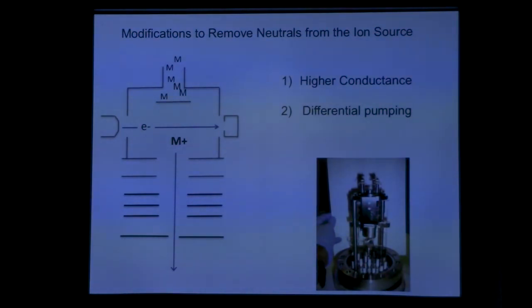And that gets them so upset that then they lose their own electron, and they become a positive ion, right? And so that's all very good, but we have now not just the CO2 or the other compounds that we're interested in, we also have this helium in there. So you're making a lot of helium ions as well as the analyte.